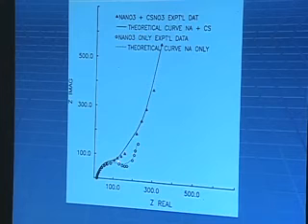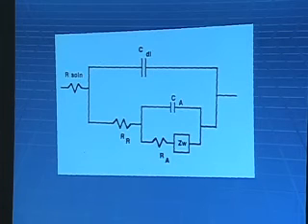But this is not atypical. And sometimes this line, you can see, totally dominates the spectrum, and you can't pull this out very well at all. That's not good. Anyhow, that line, like I said, is a fit to this circuit that I just showed you, and you can see we got a very good fit.